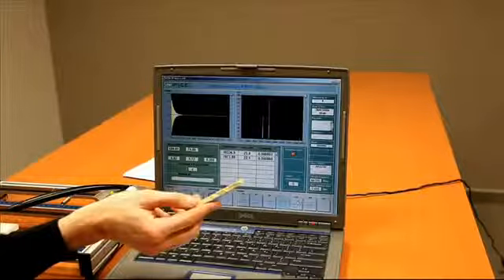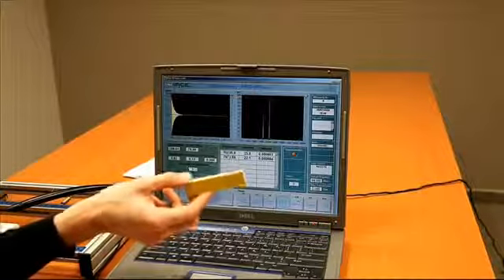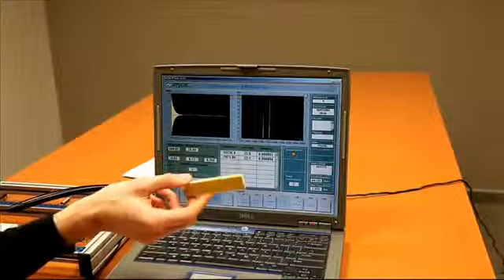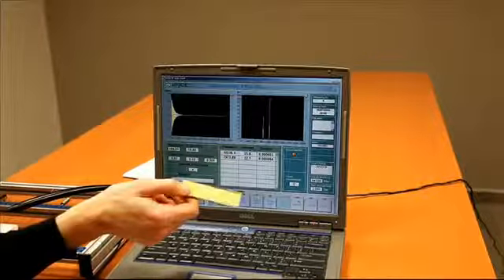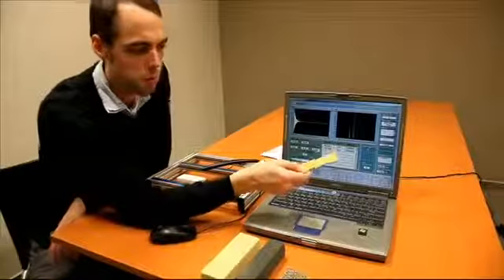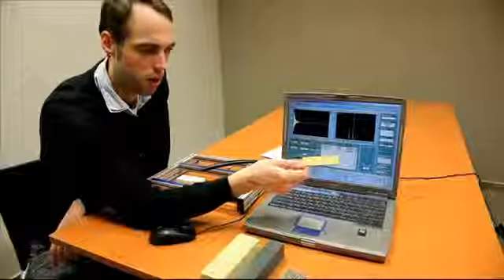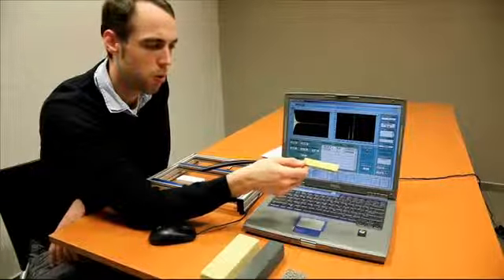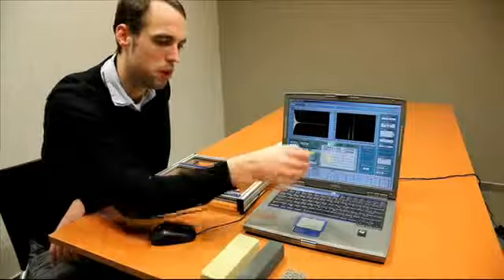If we tap, for example, a rubber type material which is not so stiff, we will not hear any ping, and it will be very difficult to measure this type of material. Stiff materials like this fiber reinforced polymer, it's possible to measure this, or maybe some glass or ceramic material or metal. It's no problem to measure this.